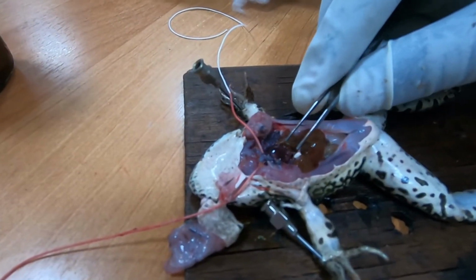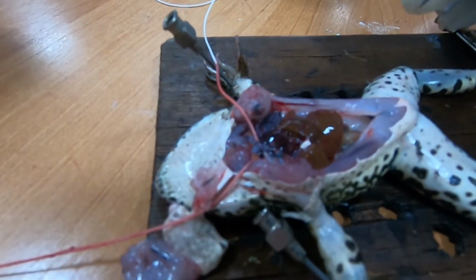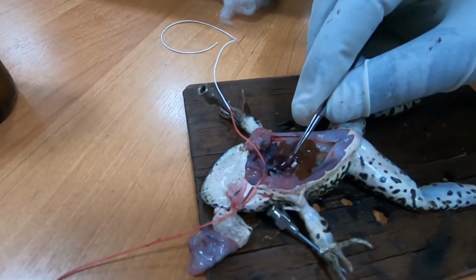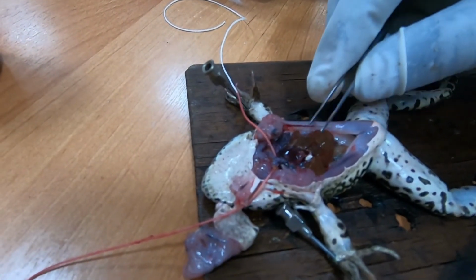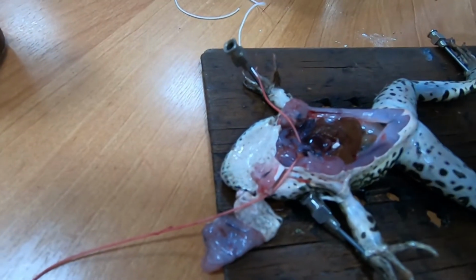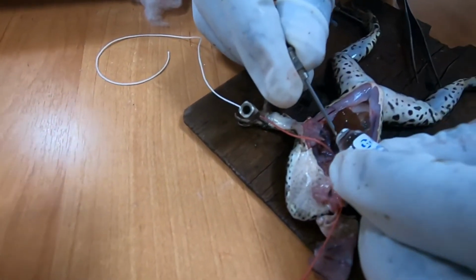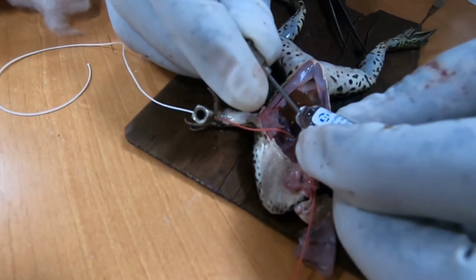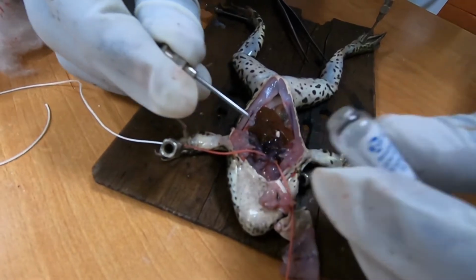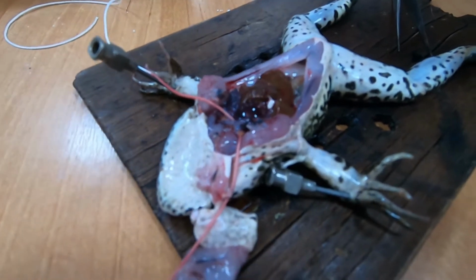So you can see the heart is now beating, still beating, but slower. We have to add some amount of adrenaline to make it function. Okay, this is how we do. We have added some quantity of adrenaline.